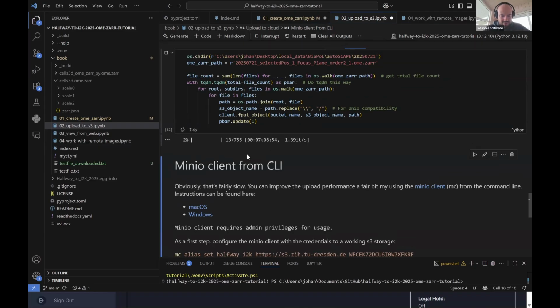So this is actually browsing quite a bit of data and uploading stuff. You can see this is already one of the downsides I mentioned earlier. There's a lot of individual files to copy around. And since I'm now not sitting in the network of this institution, this can become a bit lengthy. My connection here isn't super fast. I'm not inside the institution network where all of this would be much faster.